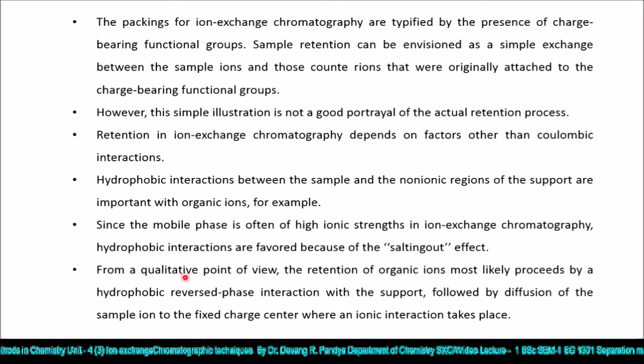From a qualitative point of view, the retention of organic ions most likely proceeds by a hydrophobic reverse phase interaction with the support, followed by diffusion of the sample ion to the fixed charge center where an ionic interaction takes place.